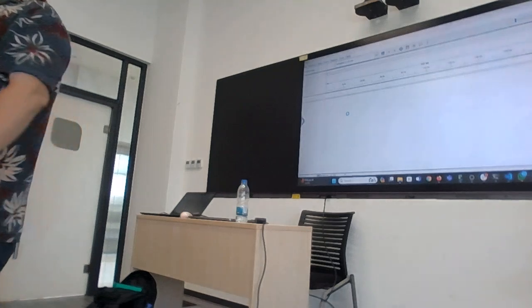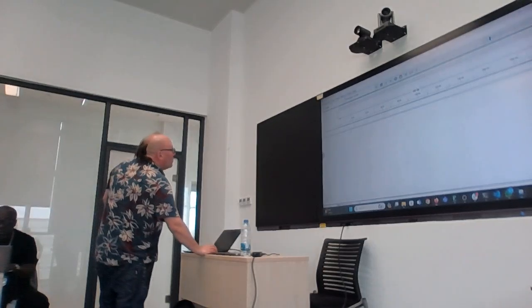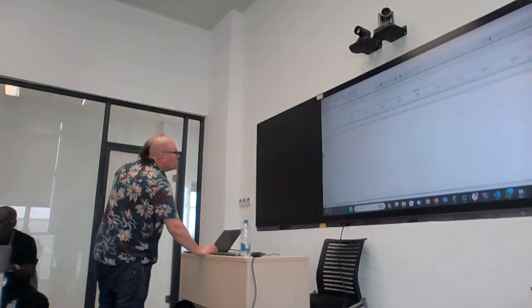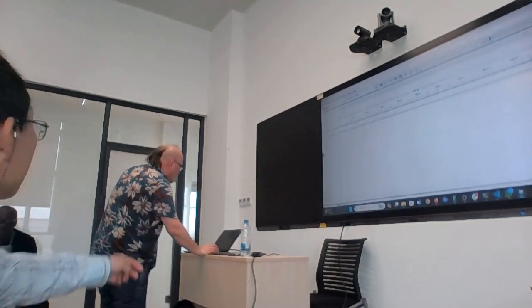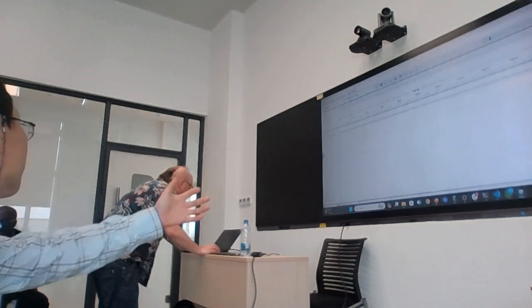If you're having problems, put up the green sticky, or wave a green sticky at me. And if you're having any problem, which we do, file menu, load from file. It's on your other screen. Oh, it's on my other screen. Thank you for that. And just put it on the main. I'm going to do that.